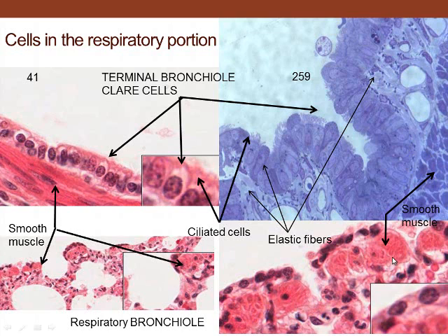Smooth muscle that we see there in the bronchioles, and we see smooth muscle here, and even little blobs of smooth muscle here. This is what closes the airway down in the cases of asthma. The contraction responds to smells or dust or pollen or something whenever it should not.